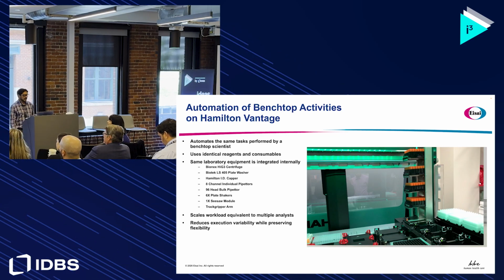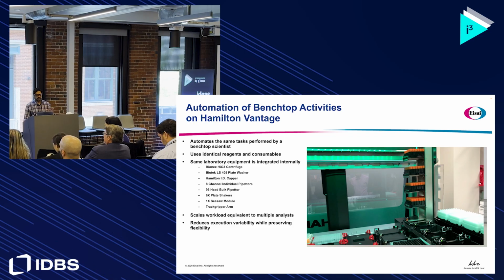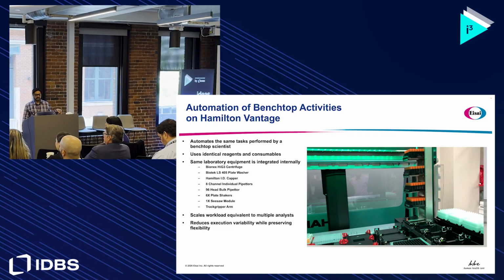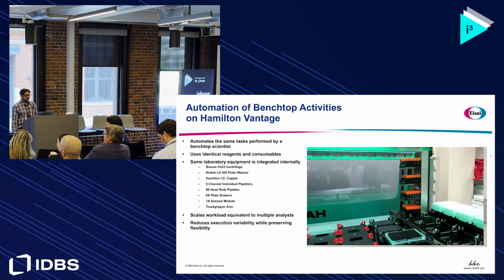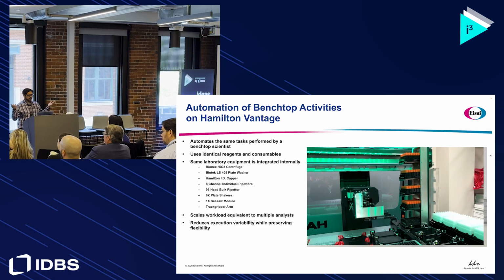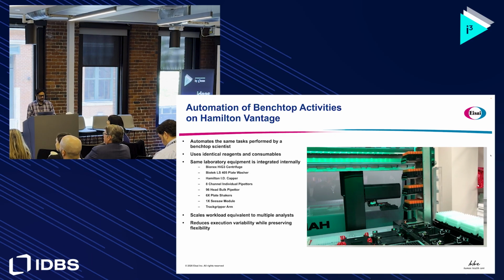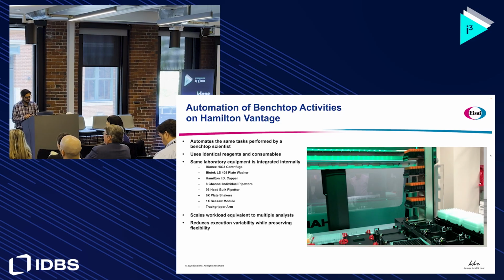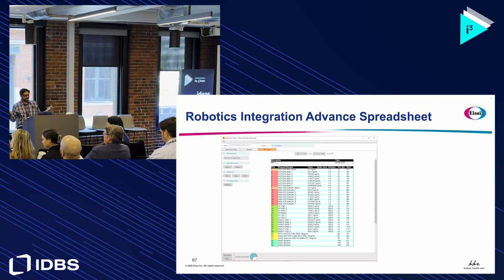Once you load it, it goes, and I don't have to do it. And it has this great track gripper arm that moves things all over the place for you, all on deck, above, underneath, everything. So it does everything. The problem with this guy is that it's just a liquid handler until you link it up with things, right? You need to integrate this in with your ecosystem for it to be able to work like a benchtop analyst. So we'll go through the workflow then.